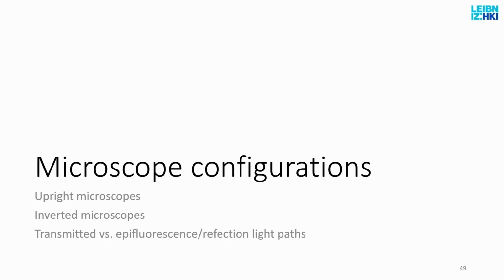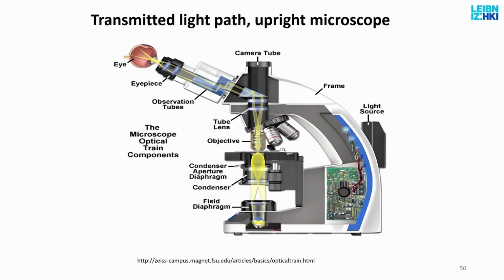Now let's see what real microscopes look like. And many of you work with them, so you know some of this already. We'll talk about the two configurations and the various light paths briefly.